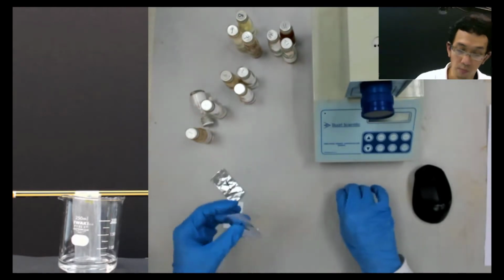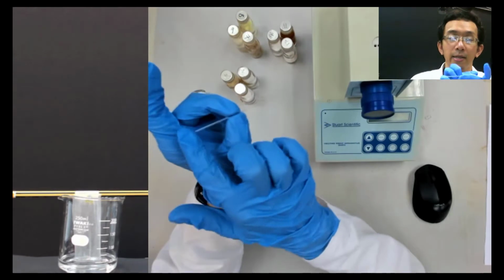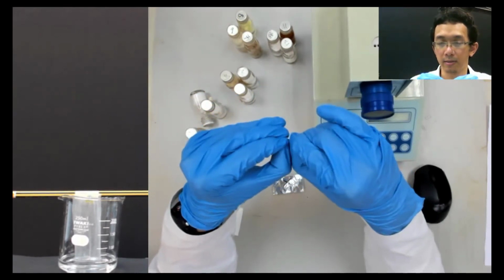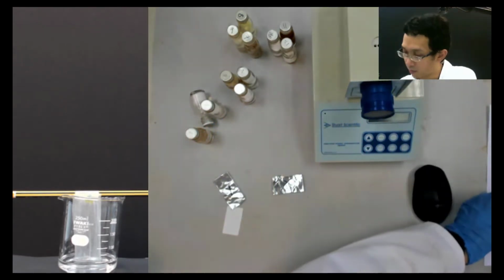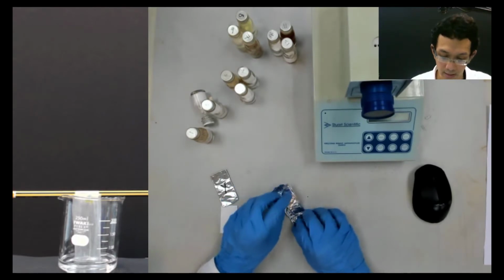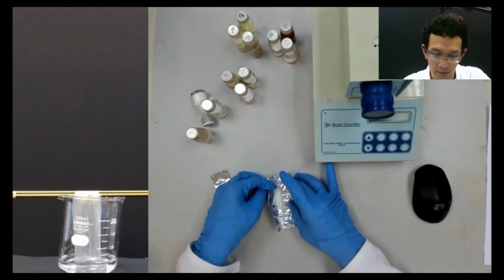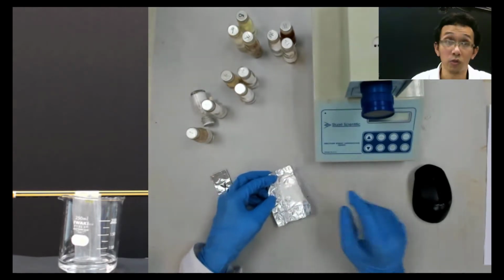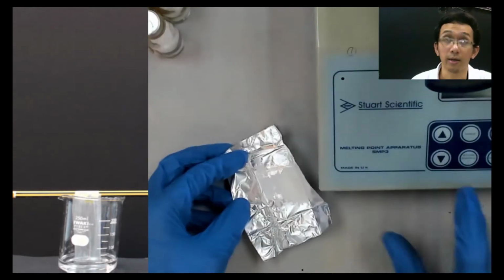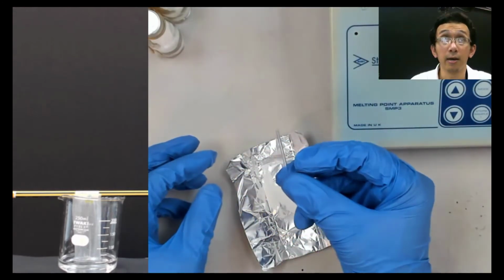So let's say now I want to put this X into this tube. Because both ends are closed, I need to break it in the middle. I put it somewhere here, and then I will open the X. Remember, this is X. I will do both together, but we start with X first. I will zoom in first because it may be quite far from you. Then I will take this capillary tube.